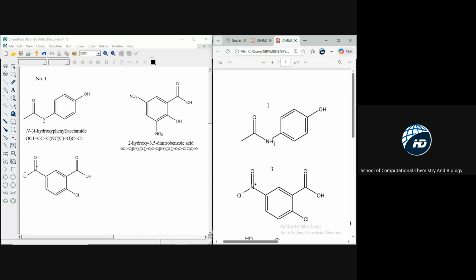It's just the software that generates it. In fact, I would even prefer the one we just did now, because the H is attached to N. So the H must be under the N, which shows that the H is attached to the N. So I would even prefer this one.